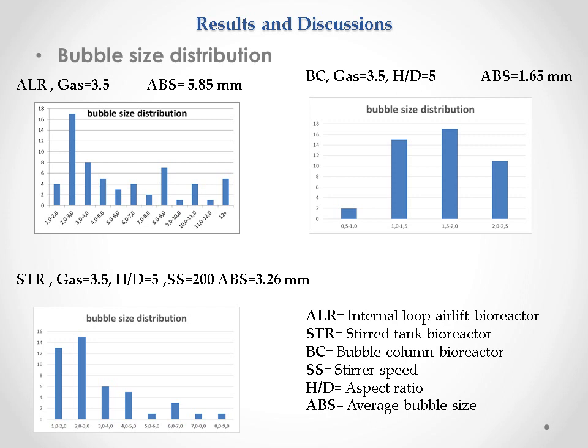Meanwhile, in the bubble column bioreactor, the disperser used is a multi-porous type. As the bubble size is the direct expression of the disperser orifice size, that's why we notice this difference. Also note that the internal tube of the airlift and the presence of the stirrer in the stirred tank play a big role too. This result is expected because it is logical.